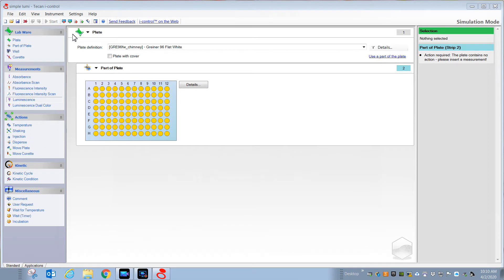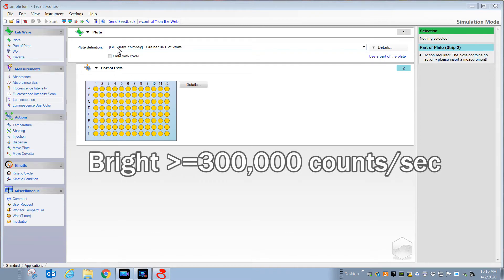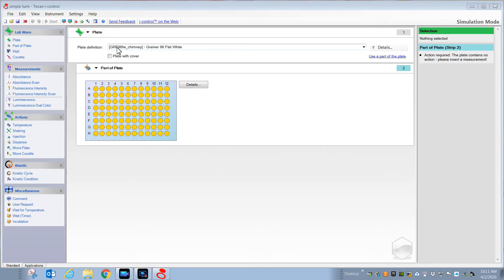The first step in setting up your measurement will be to make sure that you have selected a plate definition that matches the plate you intend to use. Generally for luminescence readings you're going to want to use a white plate, but there are some situations where white plates are not advisable. If the signals are very bright, the light from one well can radiate through into another well and register as signal — this is crosstalk. If you start to see wells where you've not placed a sample and yet you're getting signal, that's a sign of excessive signal, and that's when you might want to consider switching to black plates.